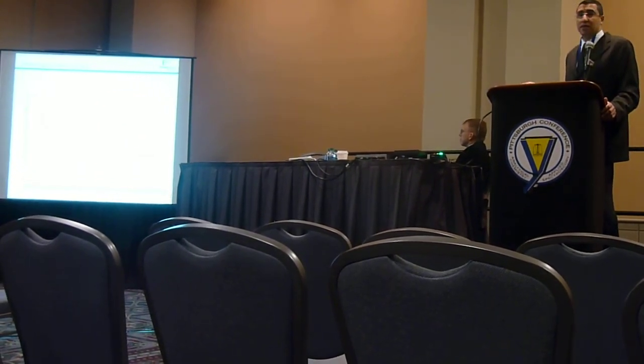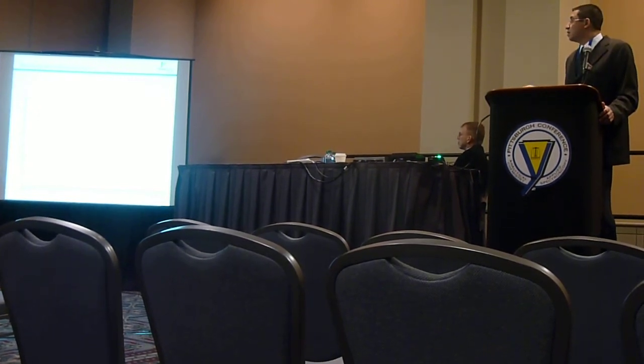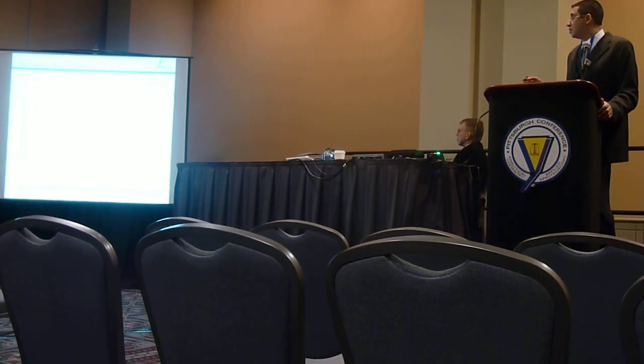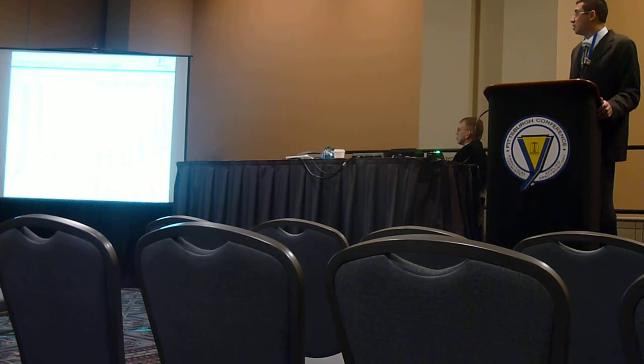I used a blank; the solvent I used is isooctane. So this is a blank run. As you see, it's a very stable baseline. And this is my separation.